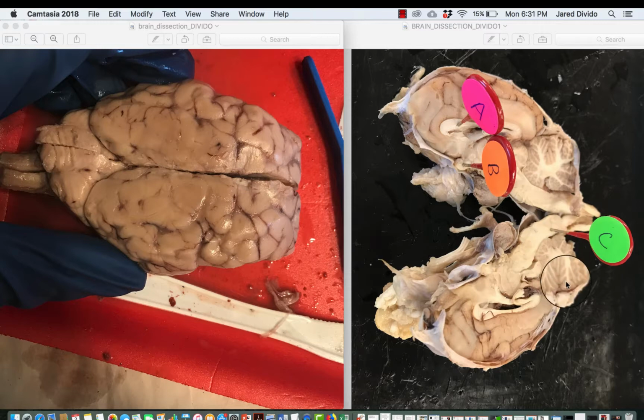We also see the cerebellum in the posterior portion of the brain, which includes the unique tree-like features. This section of the brain helps with equilibrium and coordination. If we navigate back towards the central part of the brain, we can see the pituitary gland. As the master gland of the body, it produces many hormones that travel throughout the body, directing certain processes and stimulating other glands to produce hormones in the body.